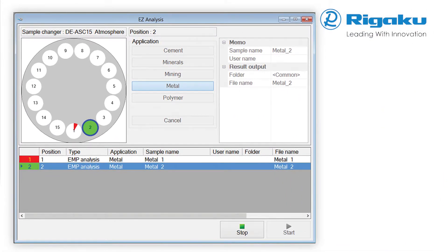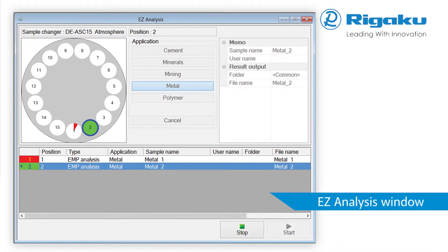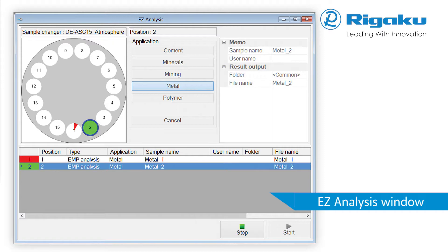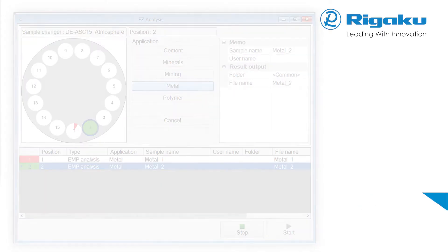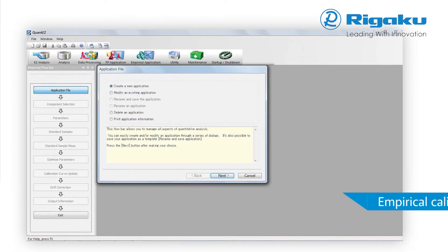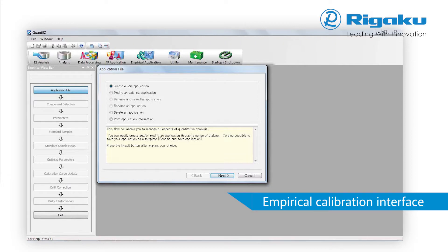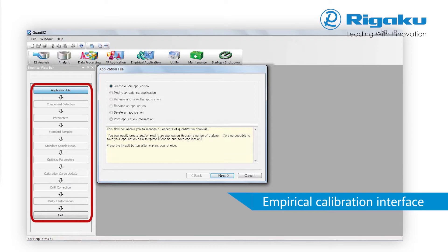Easy analysis is a best practice design feature that makes everyday routine operation intuitive. A single interface contains everything you need to know about the status of your samples, what your data measurement parameters are and a running output of your results. Based on the RIGACU easy-to-use flow bar interface, QuantEZ walks the user through the steps required to set up either an empirical or a fundamental parameters application.